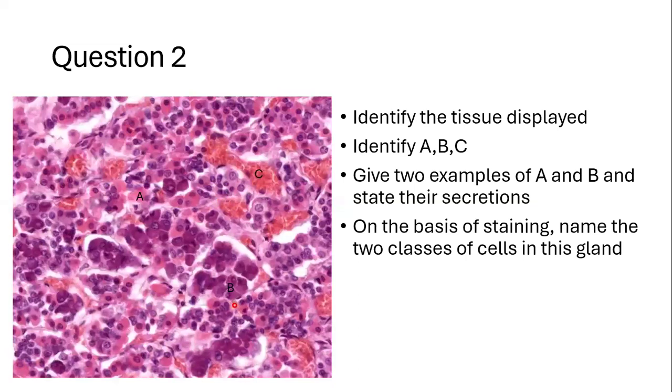What about B, basophils? Give me examples of basophils. I'm waiting in the chat box to see your replies. Examples of basophils: you have corticotrophs, good, thyrotrophs, and gonadotrophs, good. Gonadotrophs release FSH and LH, the follicle stimulating hormone and the luteinizing hormone.